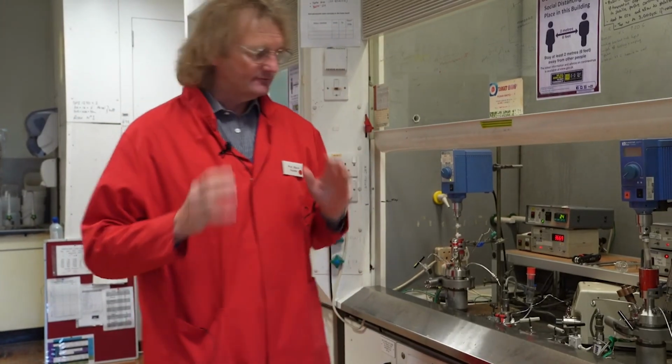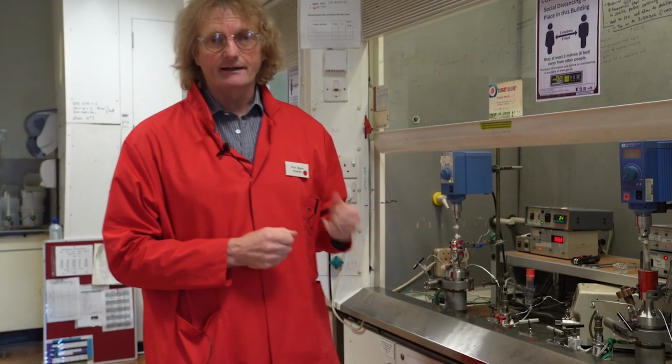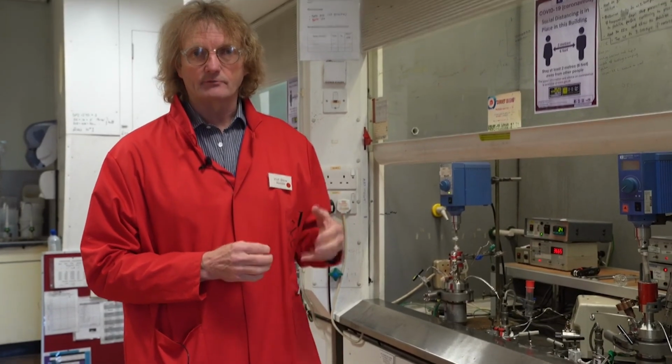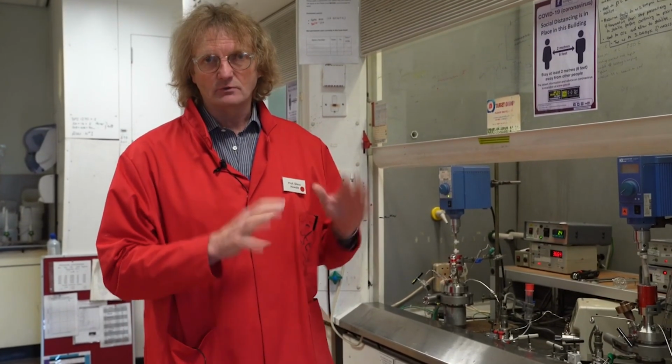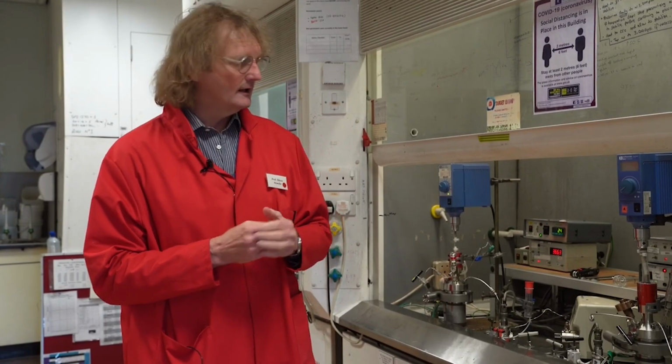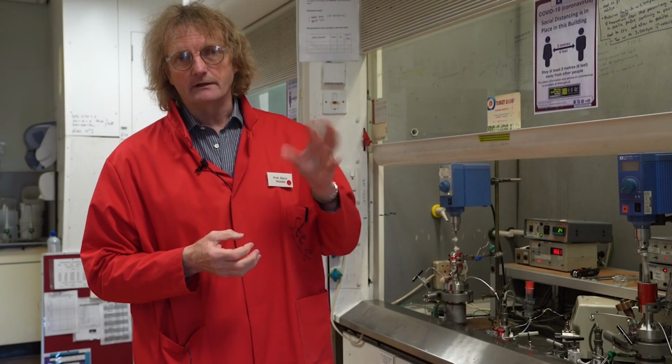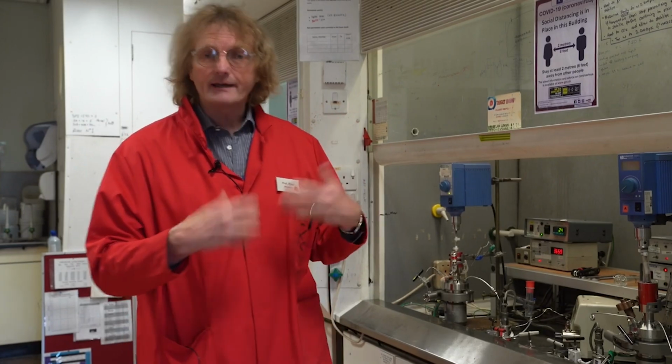Okay then, as Kartini said, she filled the reactor, and we got the monomer and the initiator and the surfactant in there, and pressurized with CO2. We went up to 3000 psi, roughly 200 bar, and then raised the temperature, so we're at about 65 degrees, so we can kick off the reaction.